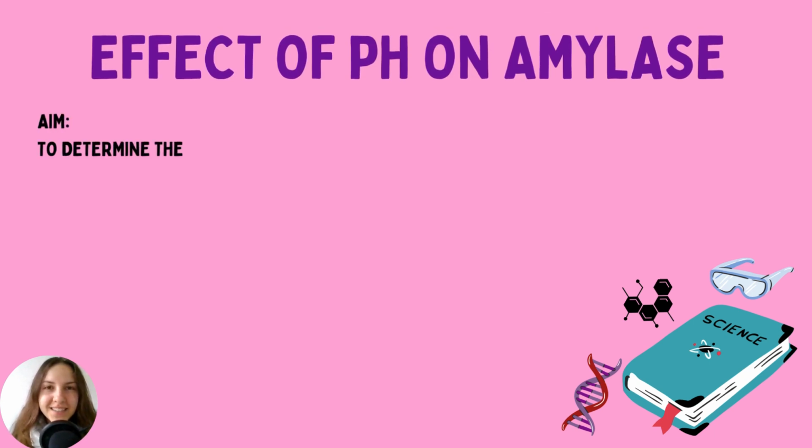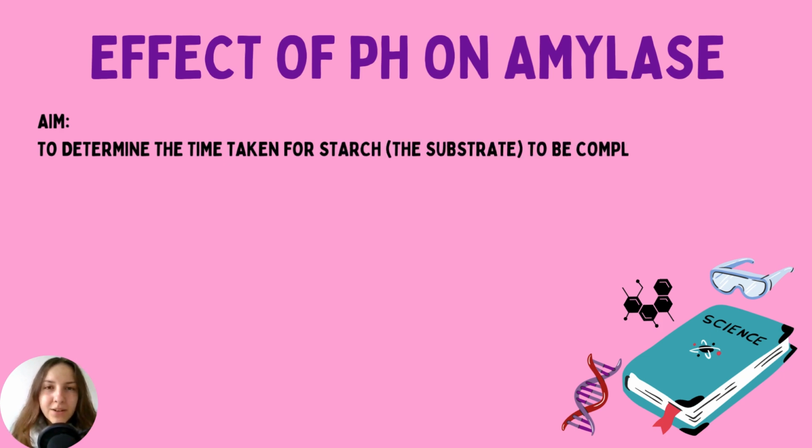I'm the GCSE science teacher, and in today's video we're going to be focusing on a required practical for GCSE biology. This is a practical that will link to the food test practical in some way.